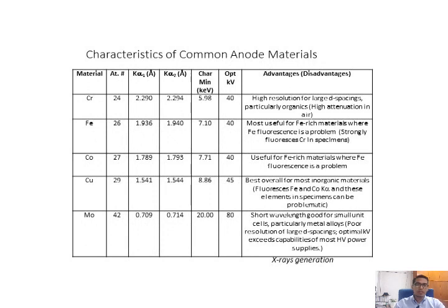If you see the table in slide number 11, we have a list of materials that could be used as anode materials. The anode material is the place where the first electron hits onto the metal, right? So different types of material will produce different sorts of energy and reaction. It depends on certain advantages and limitations, so that it can meet the specific application that it is used for.